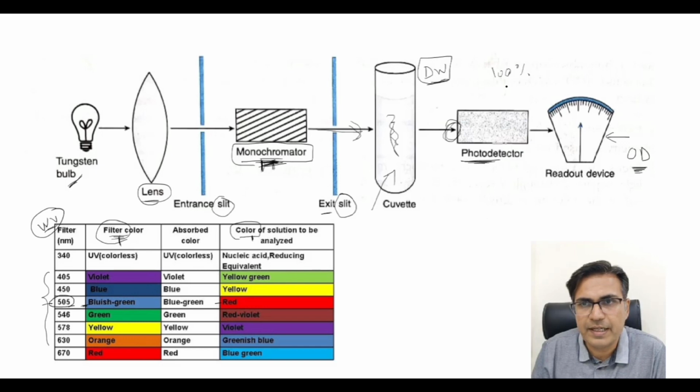Transmittance is 100%, so absorbance is 0.